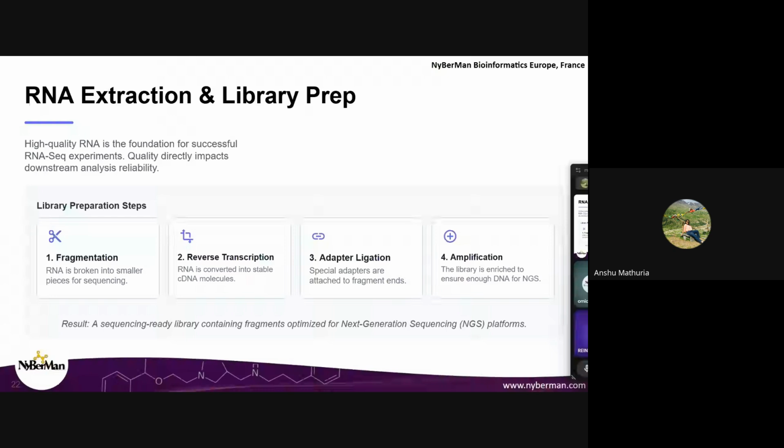If we take RNA-seq data, we'll align it to a reference genome, and then we'll quantify it. That is, after the alignment, you do the quantification: which gene is expressed more, and then you do the differential expression. So this process, you can see here right now, I have as a very cartoonish representation.